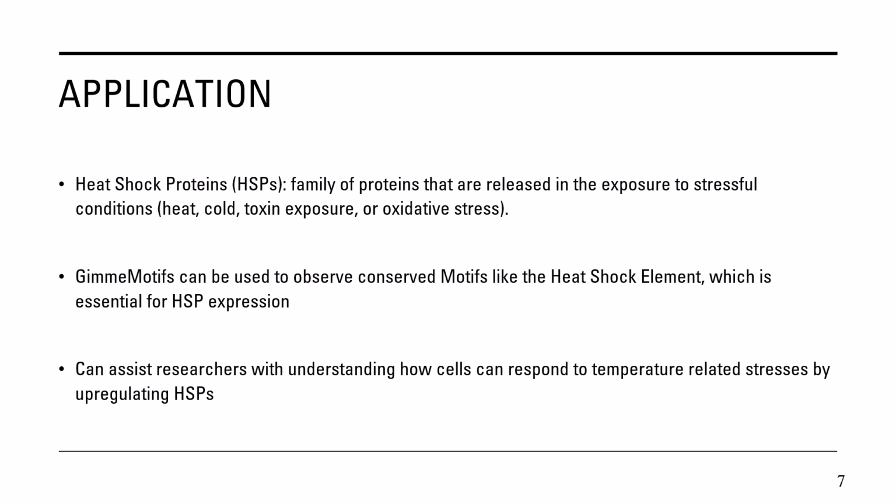Like we mentioned before, it doesn't necessarily have to be temperature related, but it makes this a very versatile tool for looking at various research projects and being able to manipulate different parameters so you can look at an array of different outcomes.